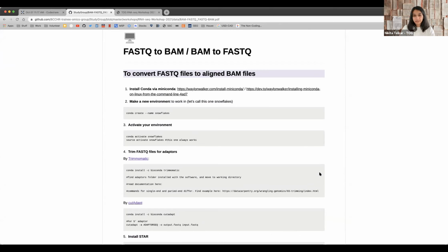No, sorry, Burrow-Wheeler alignment. Now that's not the one that I want to use. So that's why I want to convert my own FASTQ files. But if you're okay with what the sequencing center has done, you can just go ahead and use the BAM files that you get.